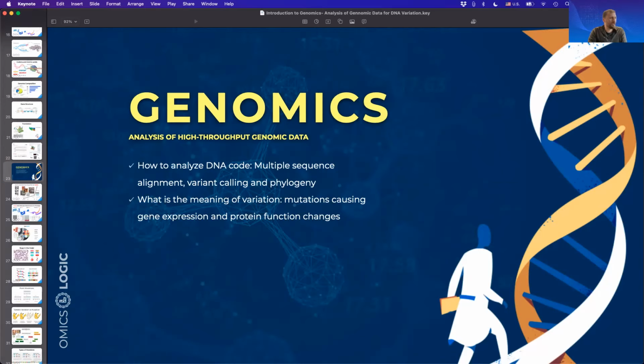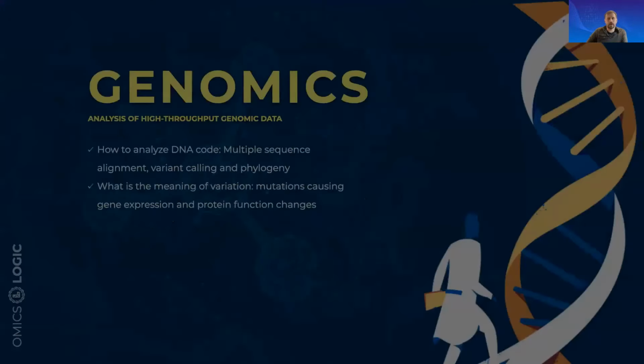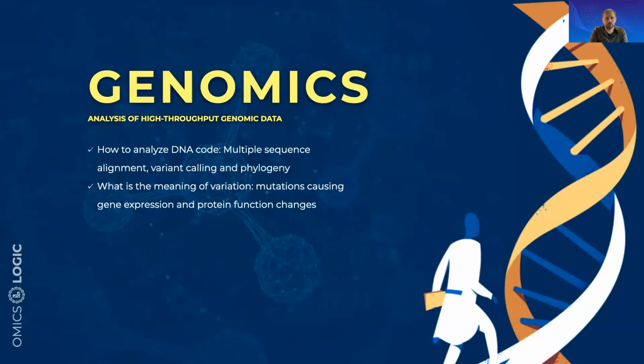So the genomic data analysis program is designed to introduce you to the tools of analyzing DNA code sequences and making interpretations based on that analysis.